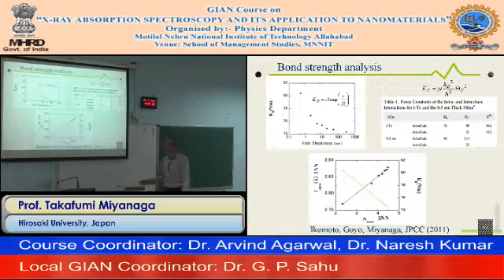And we plot the intrachain first neighbor distance, from 2.83 to 2.78, versus the interchain coordination number, that is about 4 to 2. We found a very clear linear relation. This result means that as the interchain correlations break down, the intrachain interatomic distance becomes the strongest.